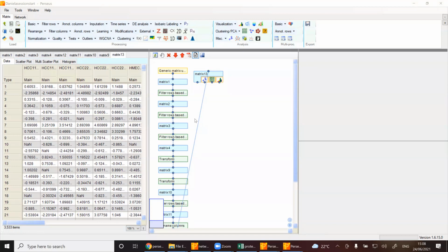However, I would like to say that about the reference channel and the normalization to apply, there is also a workflow about it. He provides a workflow together with the paper. So please follow that one because it's a precious analysis. You can go through that one in such a case.